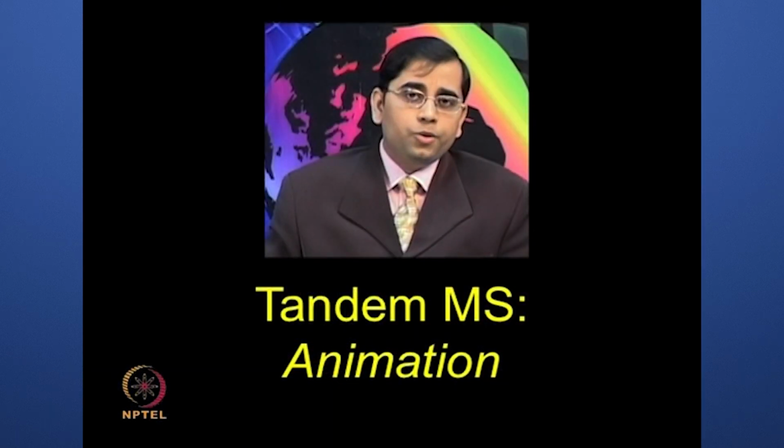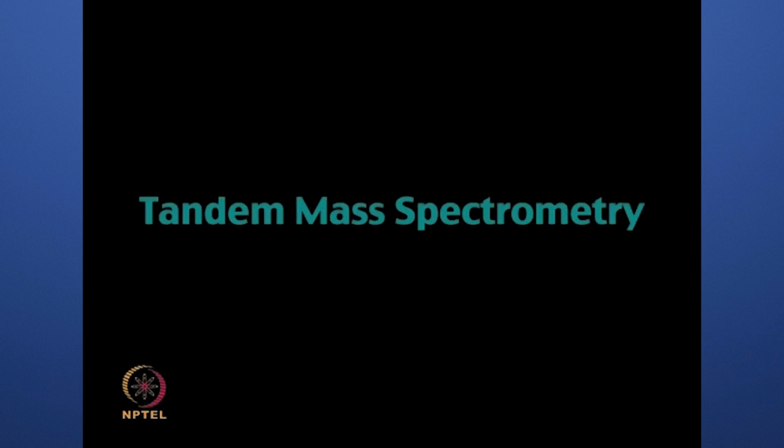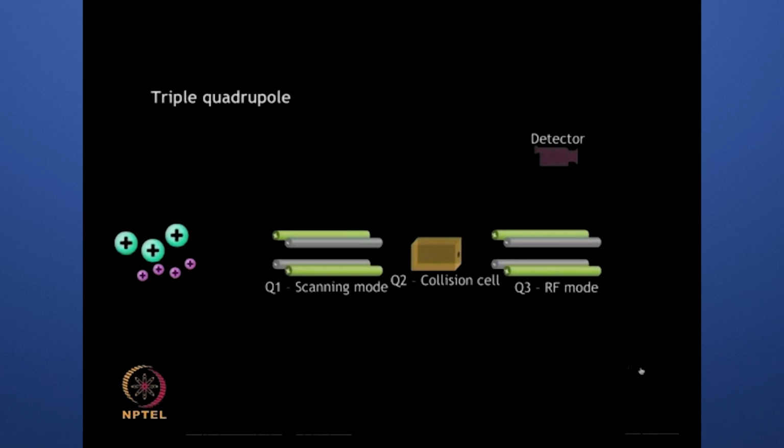For some of the commonly used tandem MS configurations, let me show you this animation. Tandem mass spectrometry: combination of various mass analyzers in tandem gives rise to tandem mass spectrometry. The triple quadrupole consists of two sets of parallel metallic rods, which are interspersed by a collision cell. The first quadrupole scans the ions coming from the ionization source and allows only ions of a particular m/z ratio to pass through.